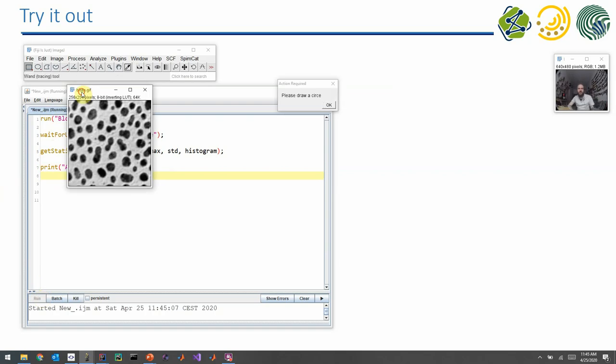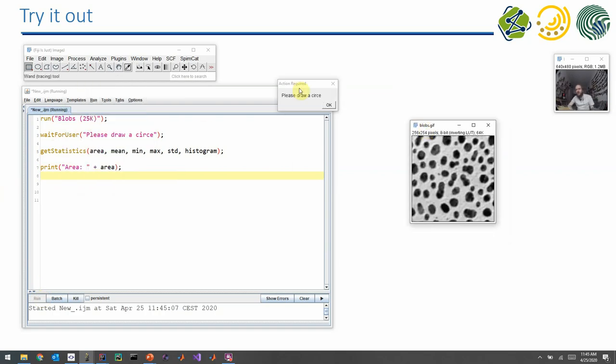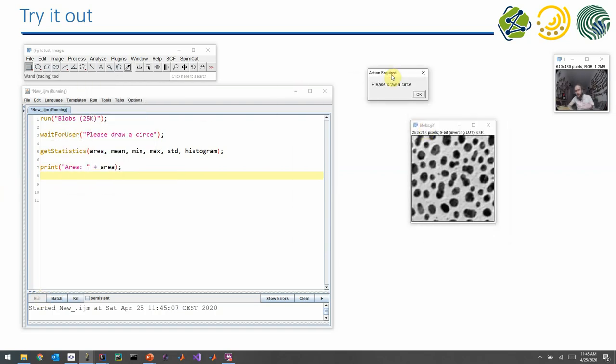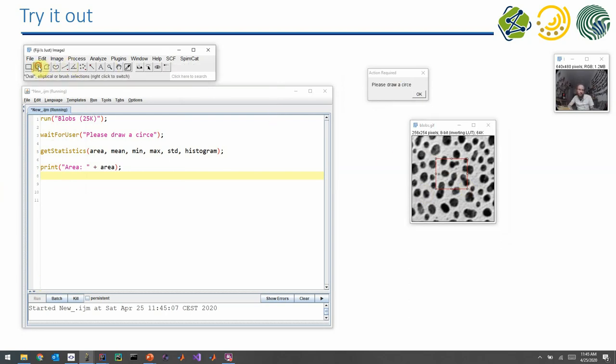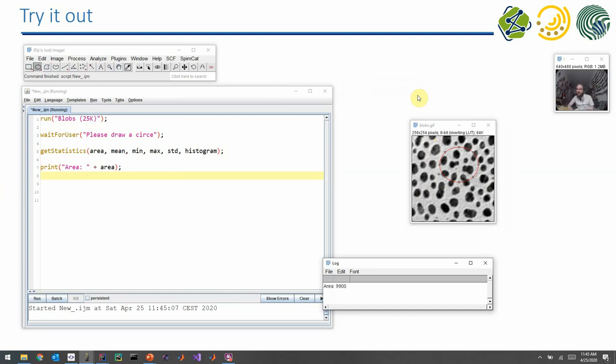And you can see now here that the image opened, and the program asks me to do something, and I can draw my circle if I select the right tool. And it will then print out the area. In this case, the area is the number of pixels within this circle.